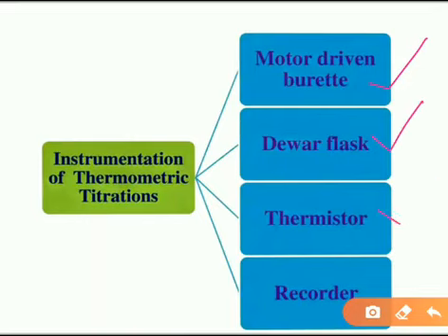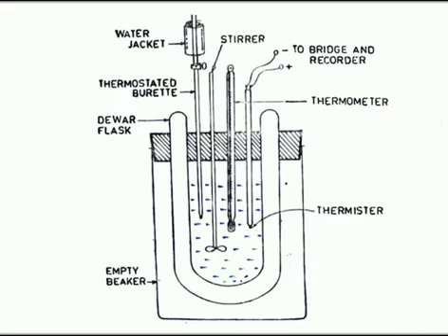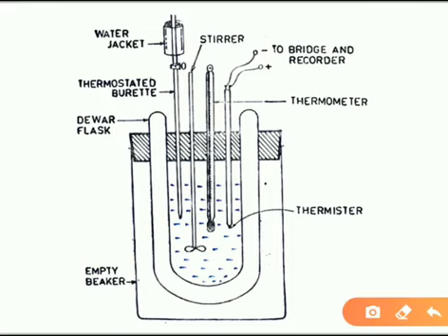The titration instrument consists of a motor driven thermostated burette, this is the motor driven thermostated burette we have here.